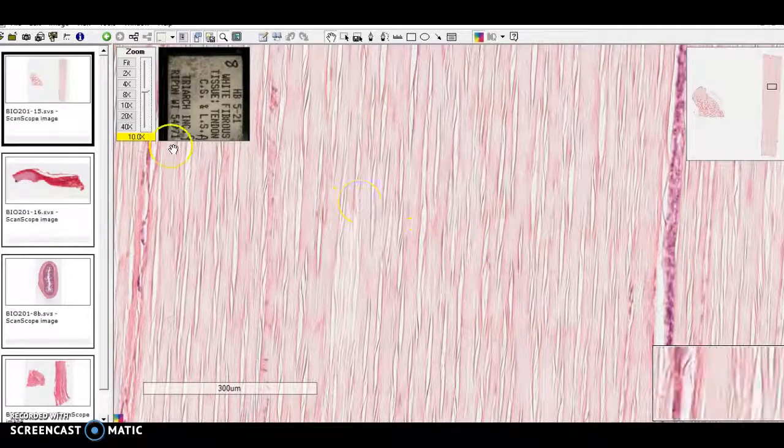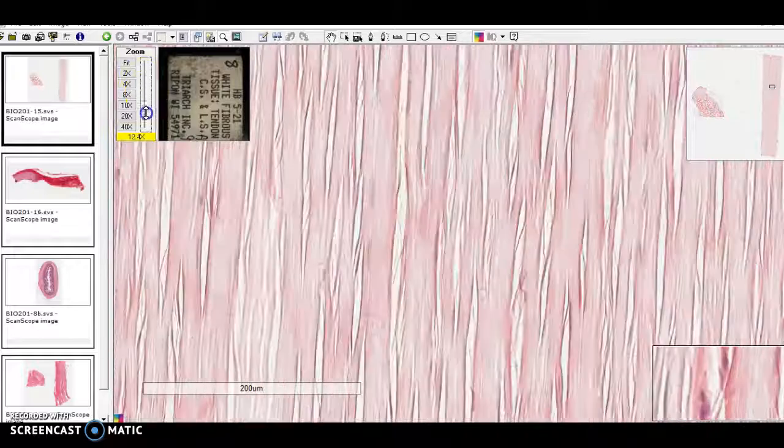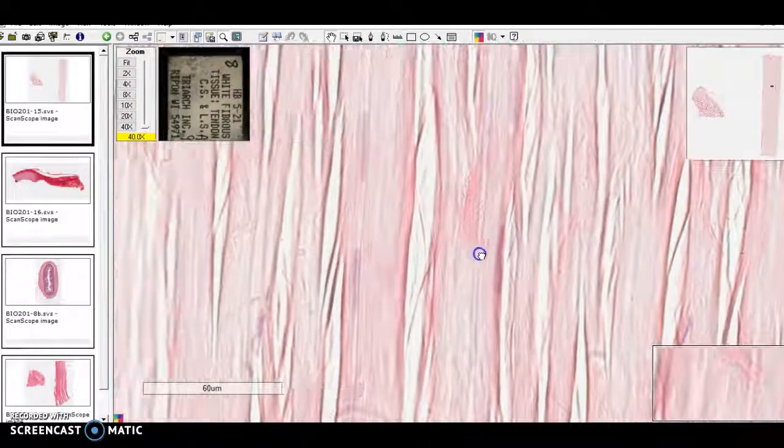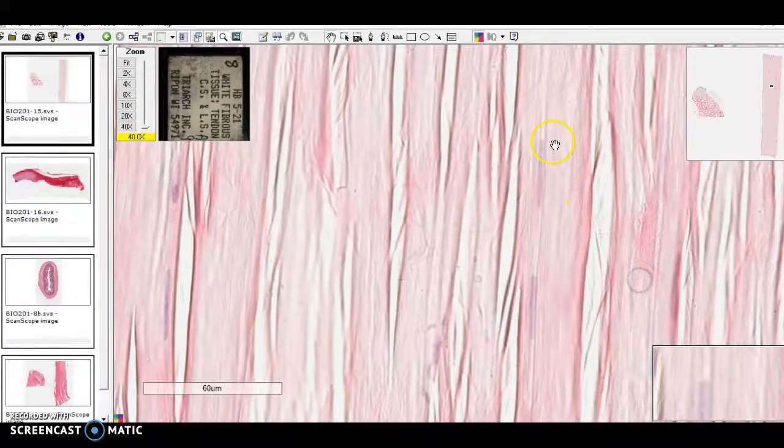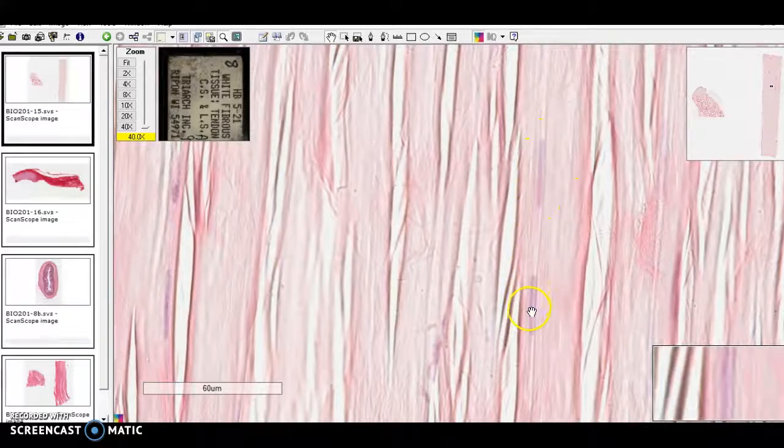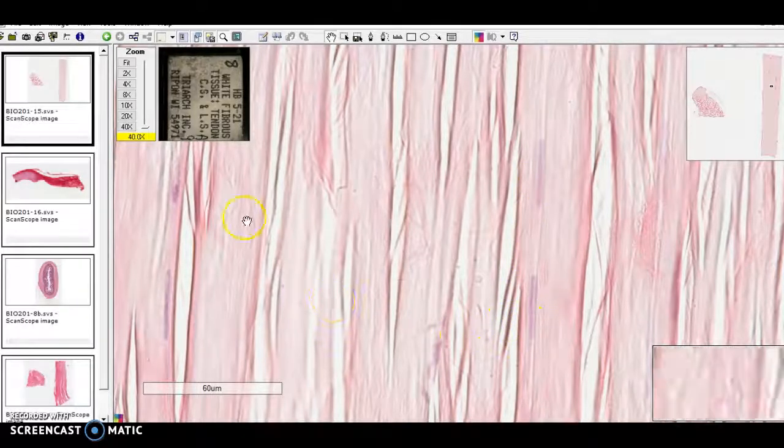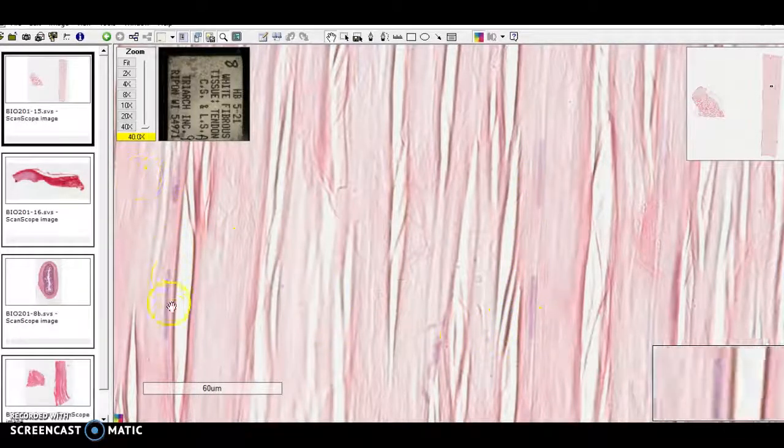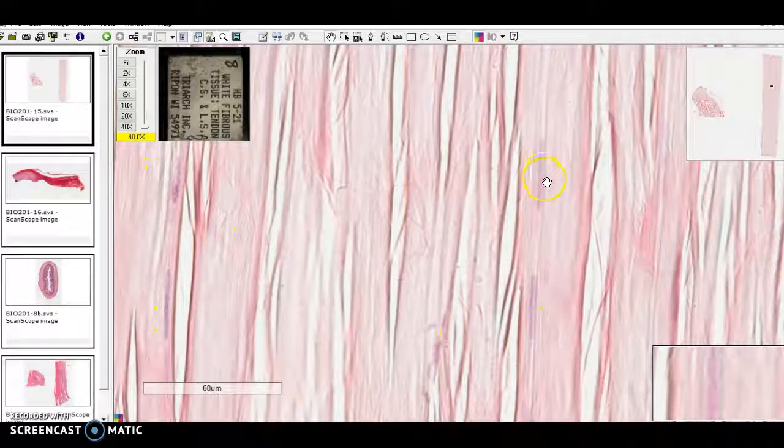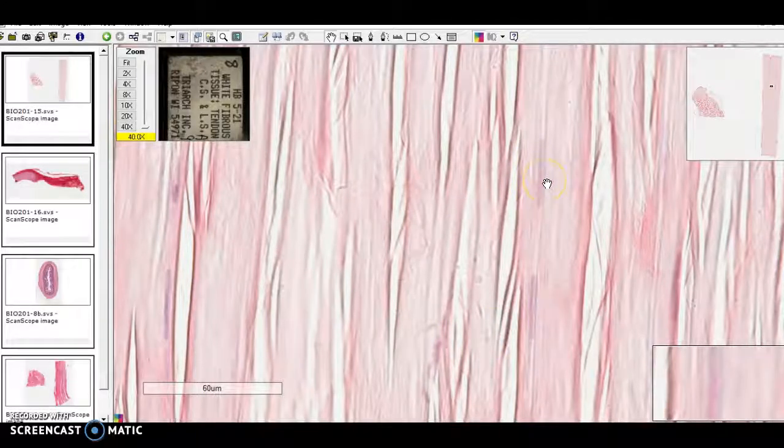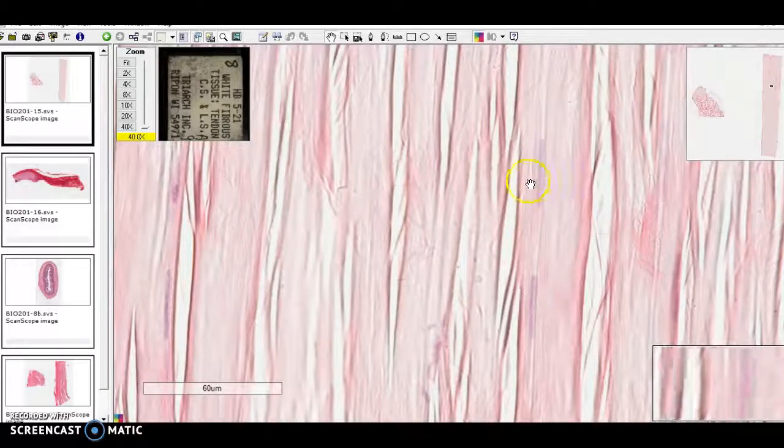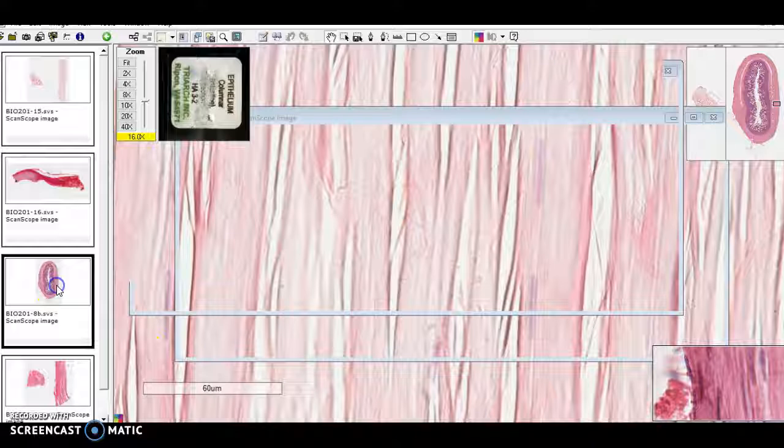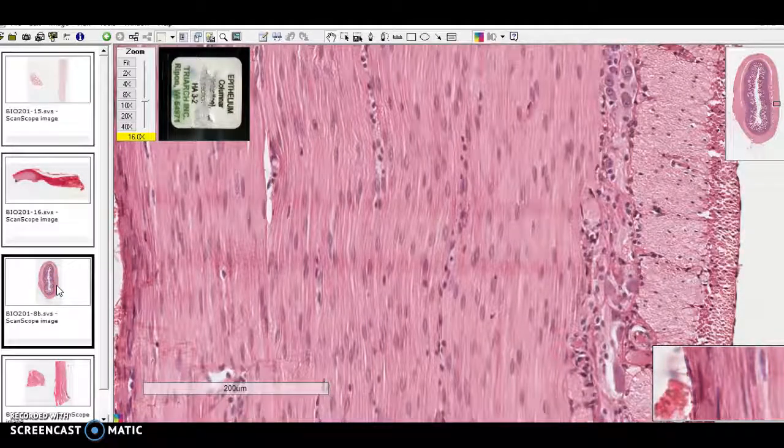So here's a nice weakly staining dense regular connective tissue. A little hint that there are some cells in there. What are we going to confuse this with? I think one thing that it might get confused with is smooth muscle. So let's take a quick look at smooth muscle tissue.